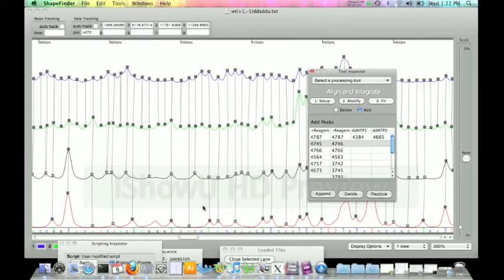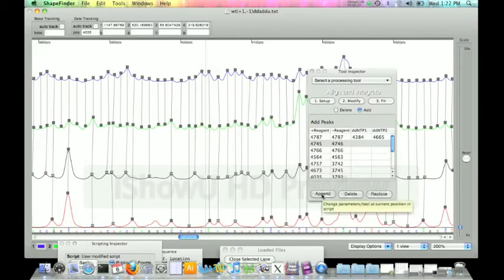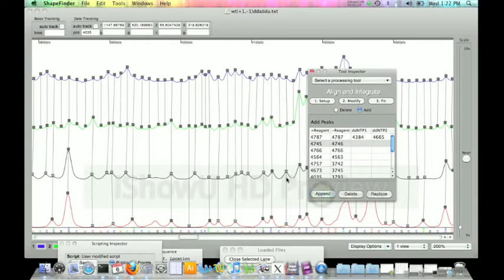So what you might want to do, even though it doesn't necessarily look like there's a peak in here, is remember that the CEQ isn't going to be able to get 100% of every nucleotide. So what's most important is that you line up the shape data with the ladders, always for the sake of the ladders, because if one spot is a little off, the fact that you have the rest of it lined up is the most important part. So we're going to go ahead and just click a spot where we think we might be able to fit a peak. Even though it doesn't look like there's a peak there, it helps because we're adjusting the sequence to the ladders, which is the most important because the ladders will always be lined up with the data. The shift between the data and the ladders is never going to move. This is the only thing that's going to move.